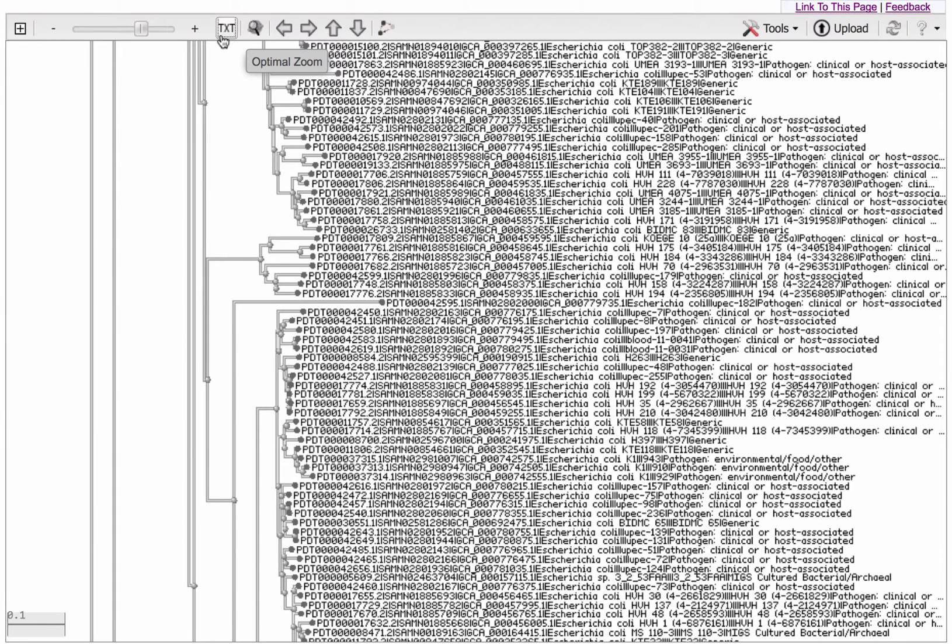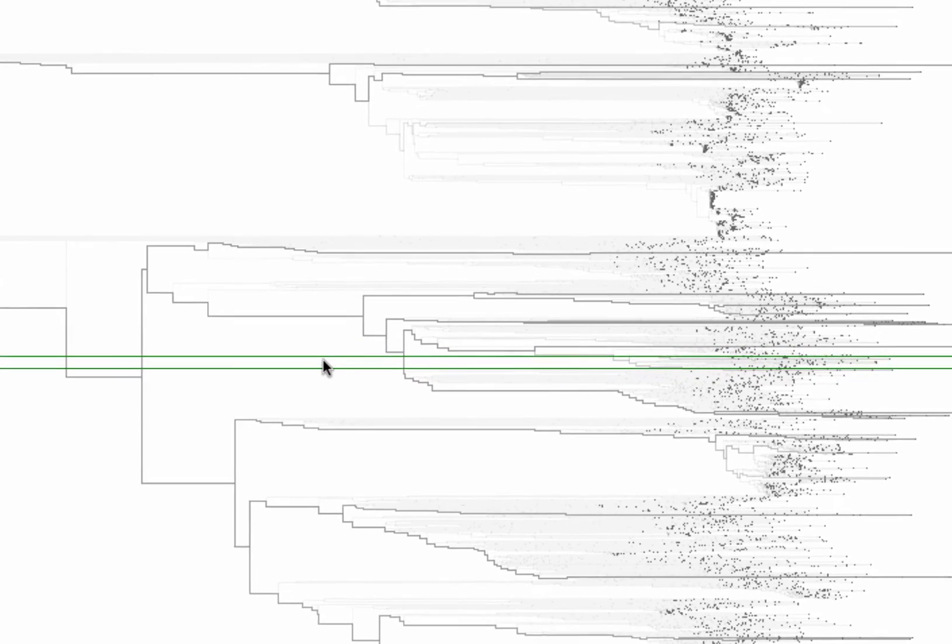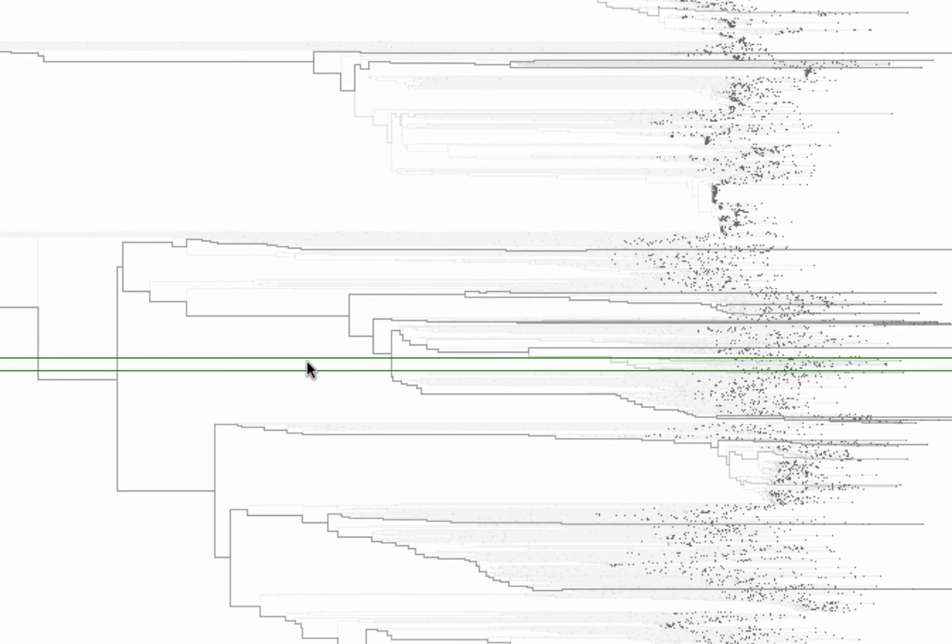Then to see in which part of the tree I am zoomed, I'll click on Overview, this magnifying glass icon. That adds this rectangle with thin green lines. It's very stretched out in this particular tree.